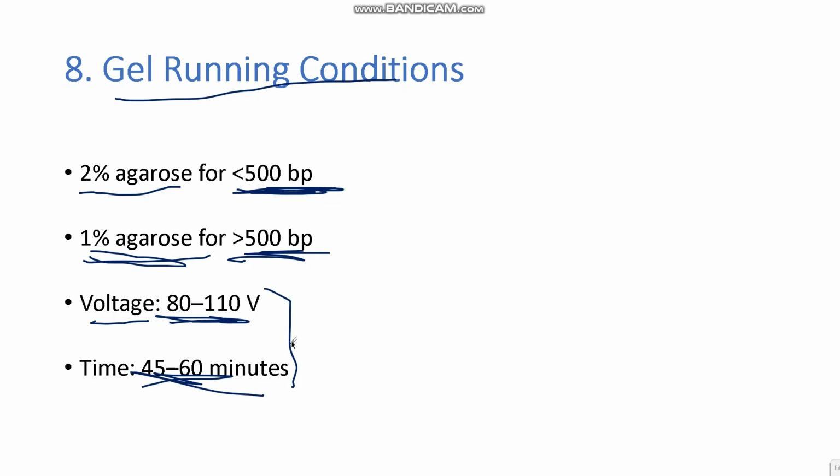If we increase voltage and also increase time, then what will happen?